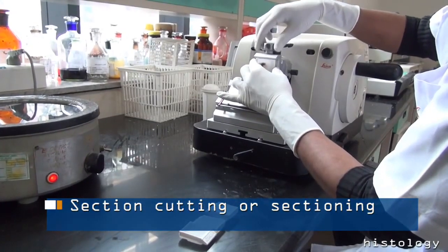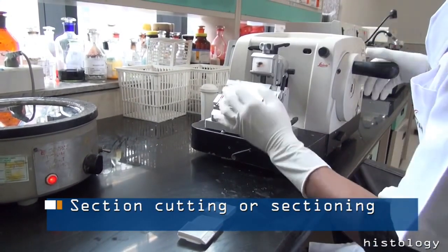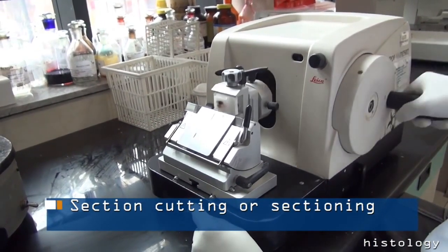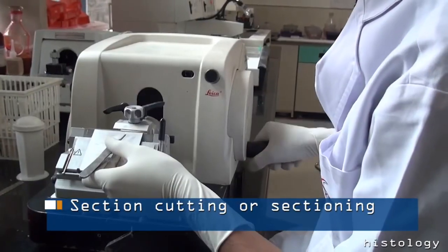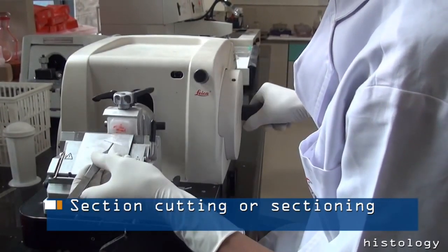Section cutting or sectioning. Once the paraffin has solidified, the tissue block is removed from the mold and placed on the microtome. In the microtome, due to friction between the knife and paraffin block, enough heat is generated with the cutting action that it allows the tissue section to adhere to each new section and form a ribbon of sections.